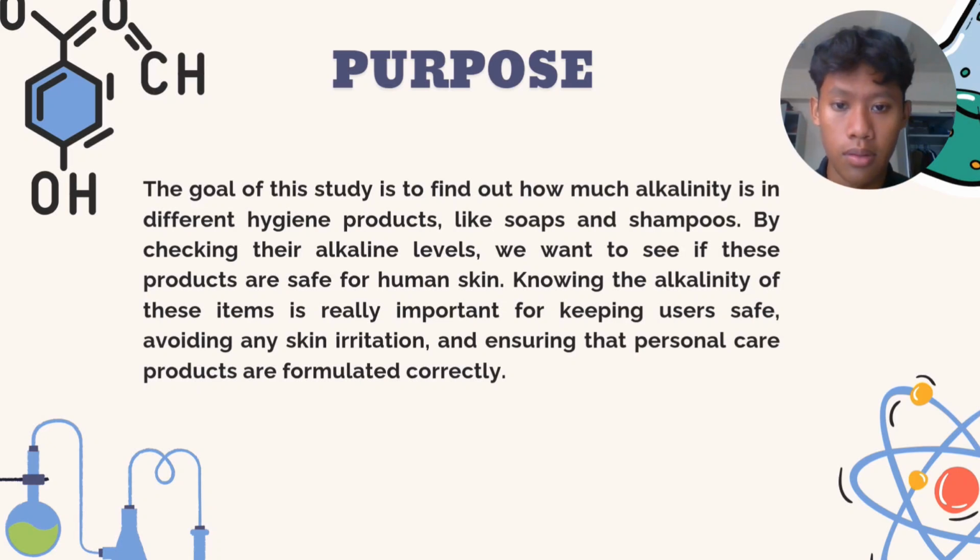Now, we look at the purpose. The goal of this study is to find out how much alkalinity is in different hygiene products like soap and shampoos. By checking their alkaline levels, we want to see if these products are safe for human skin. Knowing the alkalinity of these items is really important for keeping users safe, avoiding any skin irritation, and ensuring that personal care products are formulated correctly.